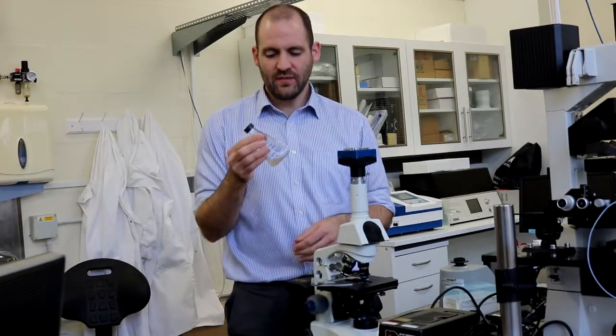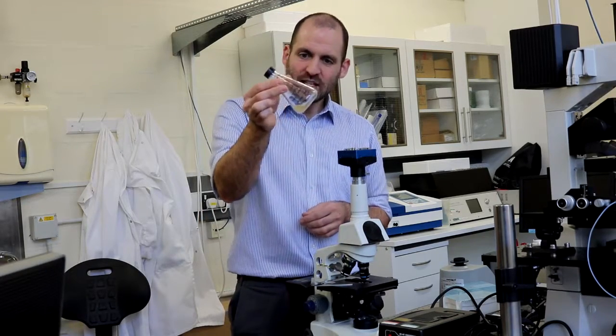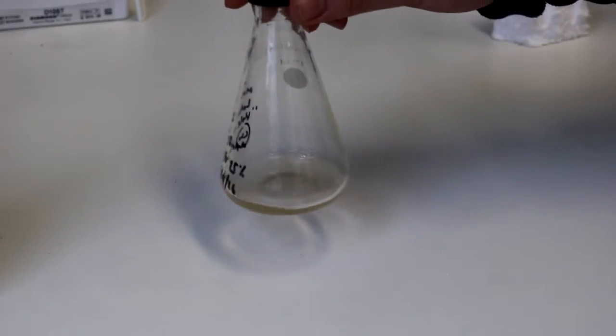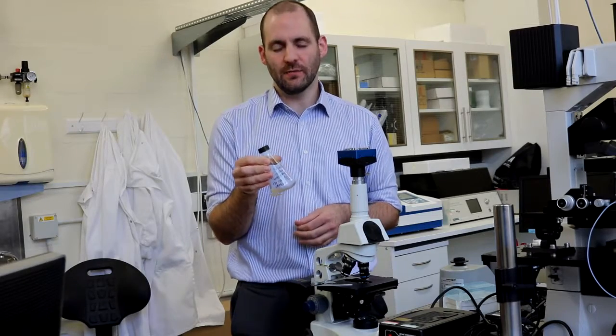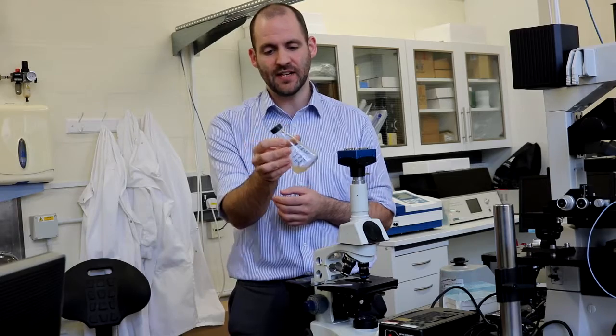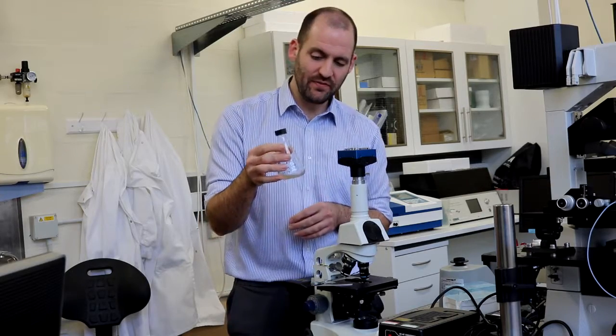So one of the things that we found in our expedition down the mine, there's a kind of cloudy solution here that's slightly pink. And this is a type of life known as archaea. They look a little bit like bacteria, but they were recently discovered in the 1970s to be from a completely different branch of the tree of life. We found these guys living down the salt mine. Very little is known about their biology, how they swim and all of these sorts of things. So it's kind of frontier stuff.